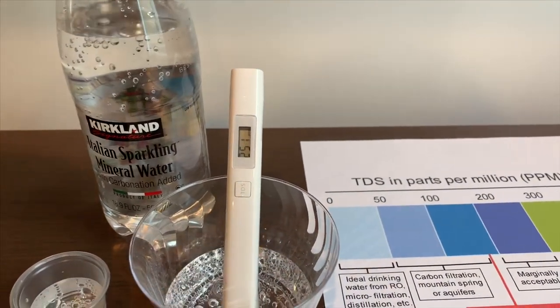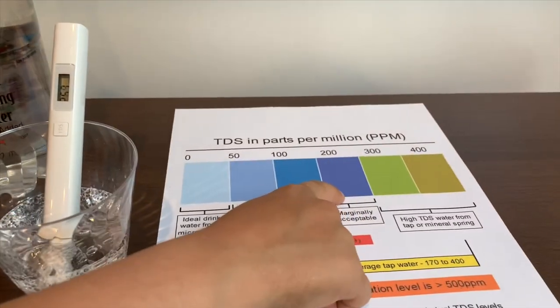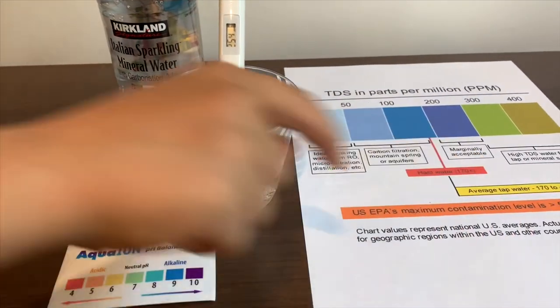It is in the 200. That is okay to drink, and it's average tap water.